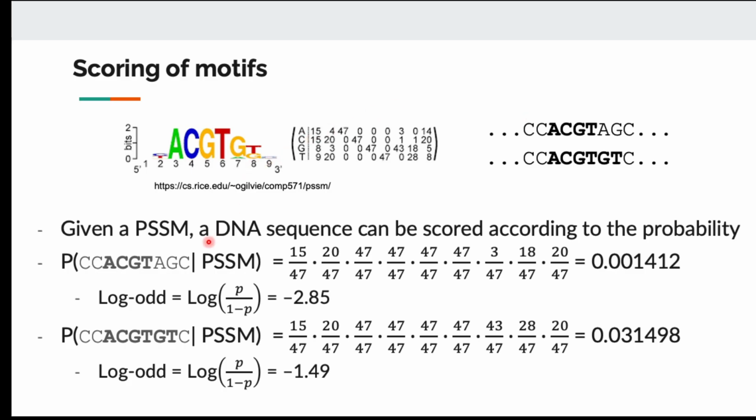The simplest thing you can do, because you know the motif, is this: the motif is a probability profile of which nucleotide you're going to observe at each position. For example, the first position here, where there is almost nothing, right? This is because all 4 nucleotides can occur with almost the same frequency.